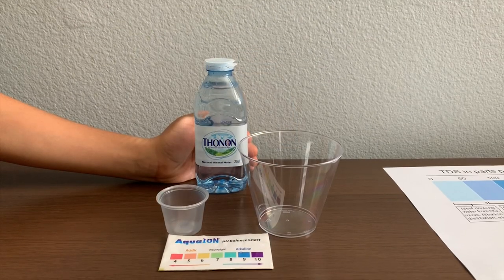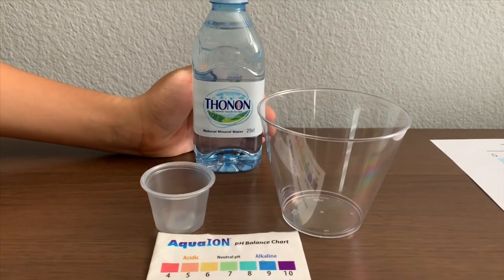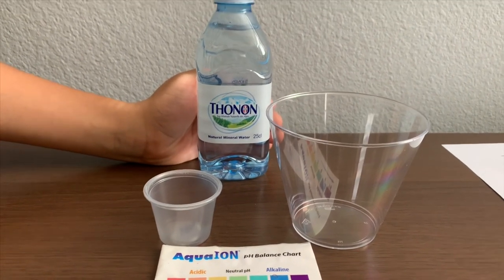This is the known natural mineral water source from France. We bought it from Germany. Let's test the pH and TDS levels.